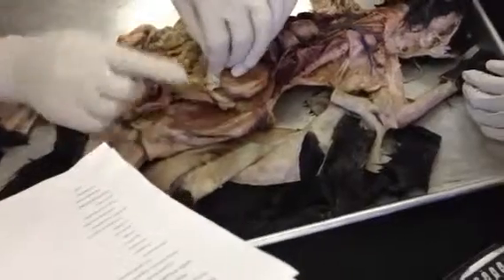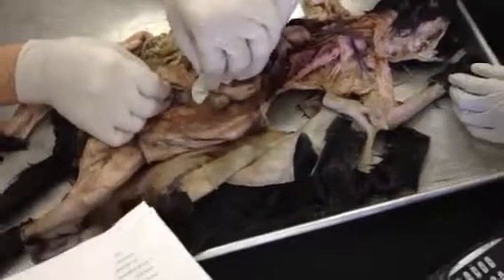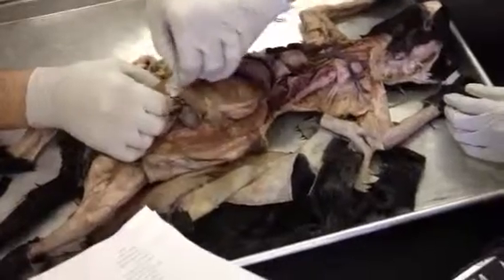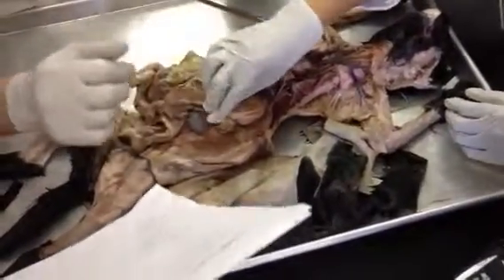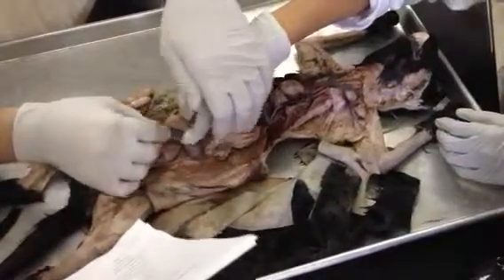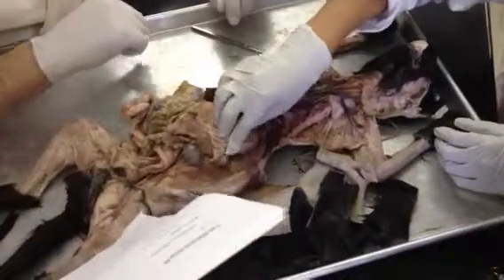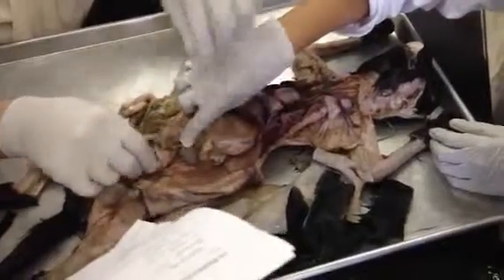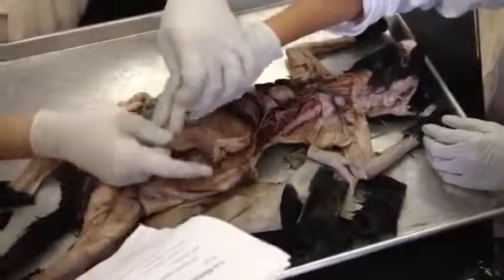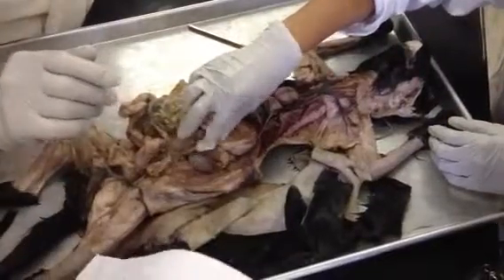On the left end of the greater omentum, that would be over here, this structure right there, big, long, thin structure. On a human, it's round. On a cat, it's long and narrow. That's the spleen. Give me your thumb. Try to find the difference between that and the omentum. Feel the spleen. You got it. That's it. No, that's the stomach again. That's spleen. And in all of this goopy stuff right there, all of that is greater omentum. That's spleen, yeah.